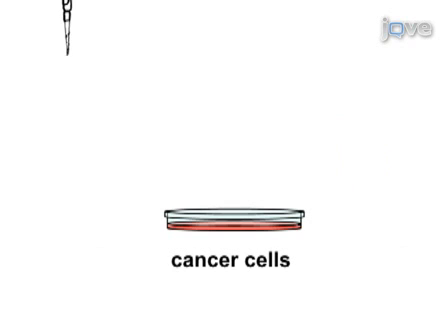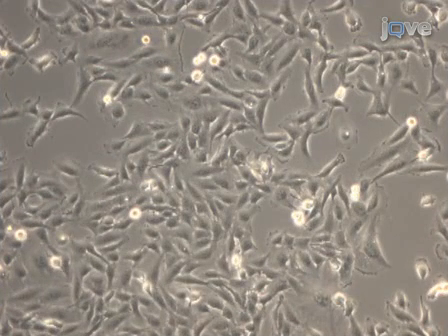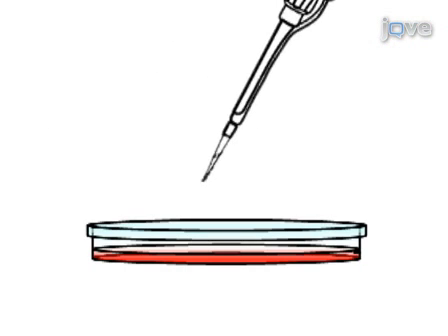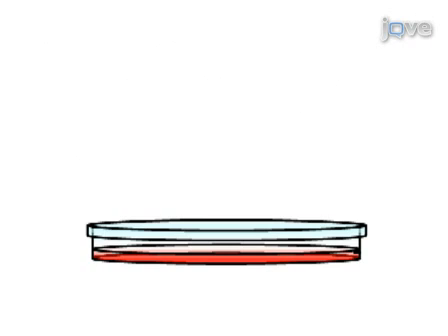Beta-1 positive cancer cells are then seeded so that the confluency is 70% to 80% 24 hours after seeding. In the next step, the shRNA expressing bacteria and the cells are co-incubated for 2 hours. Finally, the co-incubation is terminated by antibiotic treatment of the cancer cells.